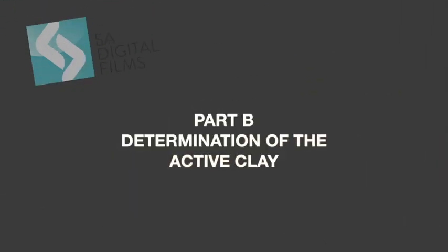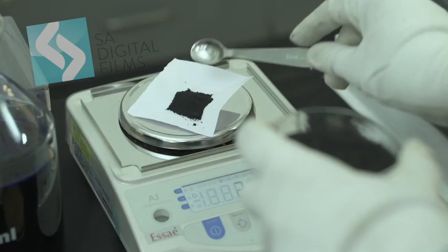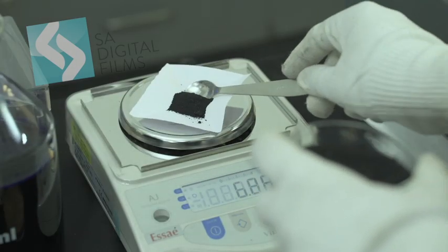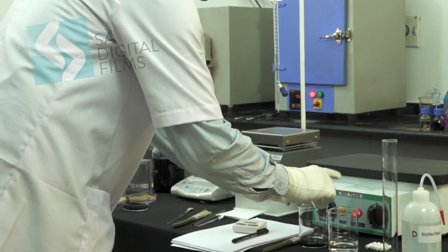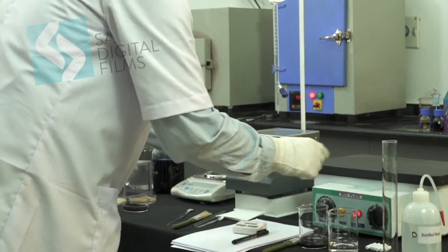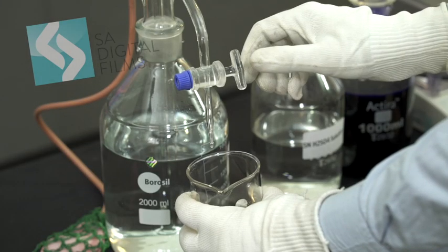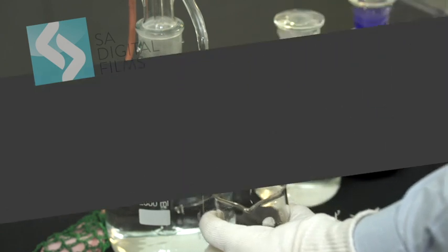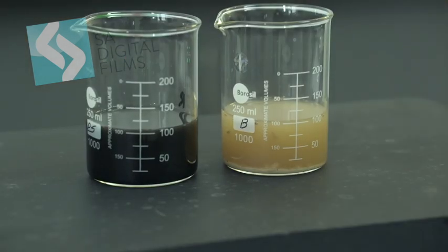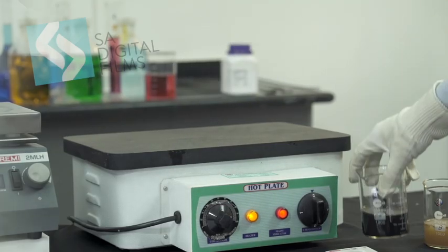Part B, to determine the active clay content. Step 1. Weigh accurately 5 gram sample dried at 110 degrees Celsius and cooled. Step 2. Transfer it to a 250 ml beaker containing 50 ml distilled water. Step 3. Add 50 ml of 2% tetrasodium pyrophosphate to the solution. Step 4. Heat to boil for 5 to 10 minutes. Remove from hot plate and cool.